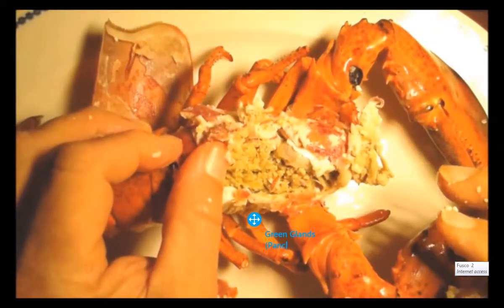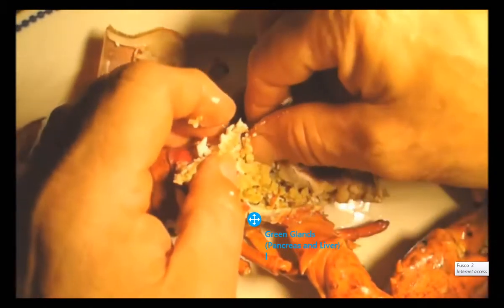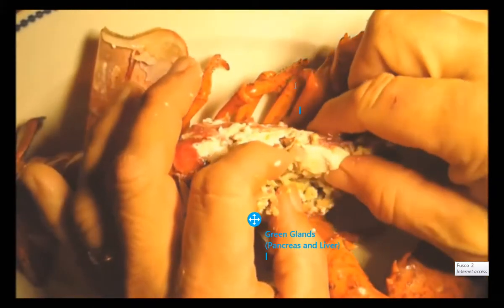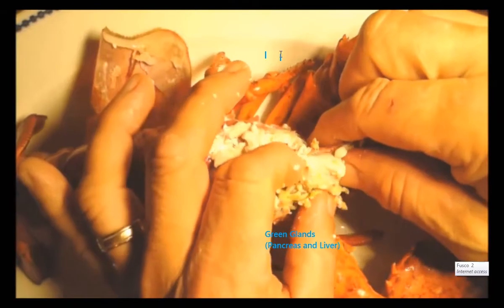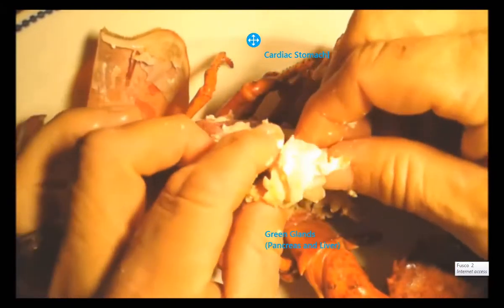The green digestive gland cleans the blood. Lobsters do have a heart; the heart is located back here. This is one of his stomachs — the cardiac stomach — and I'm going to take this out and show you something.